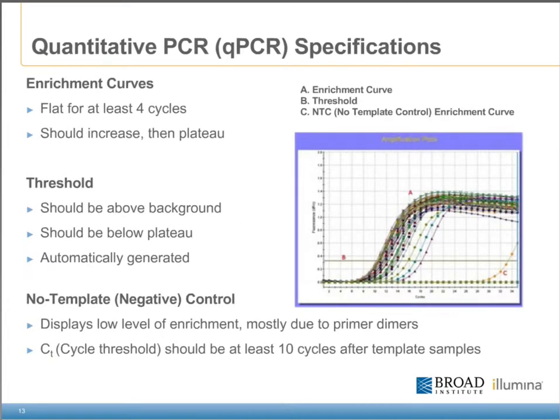Here on the right we see a typical qPCR plot. We keep an eye on three basic aspects. First, we verify that the sample produces an enrichment curve, labeled A in the graphic. We want the enrichment curve to be flat for at least four cycles of PCR, then increase, and then plateau. Second, we look at the threshold, labeled B in the graphic — an automatically generated line which should be above the background and below the plateau. Third, we look at the no-template control curves, the negative control, labeled C. These negative control wells typically display a low level of enrichment, mostly due to primer dimers, and their amplification should occur at least ten cycles after the experimental samples.